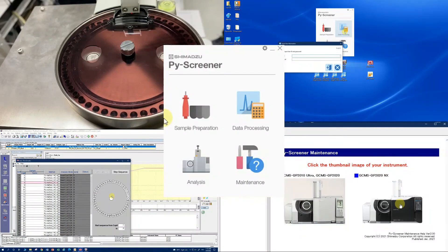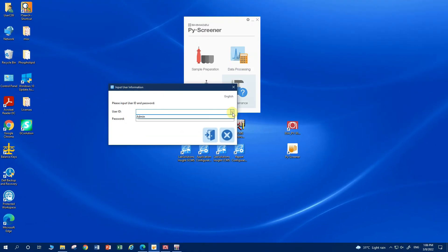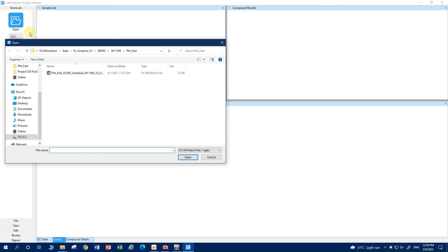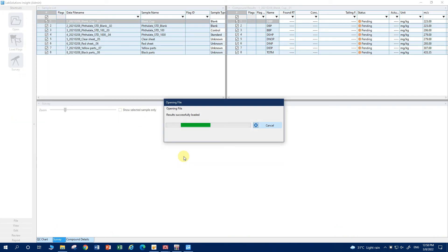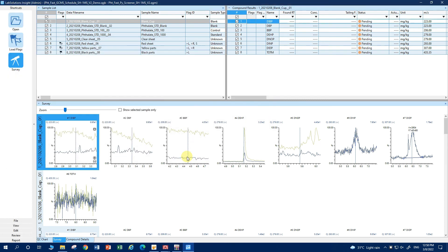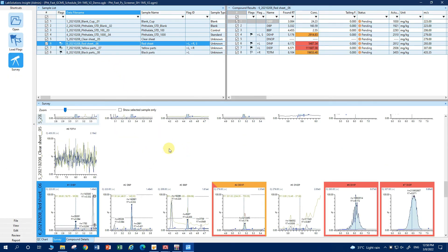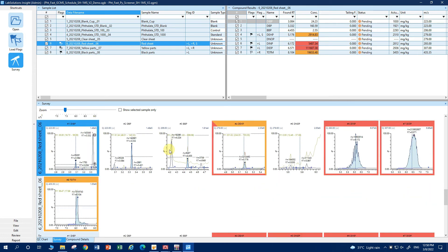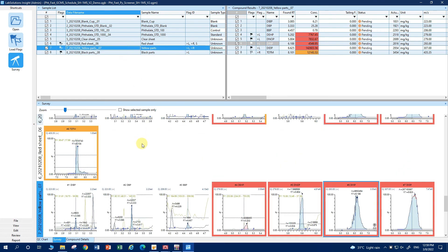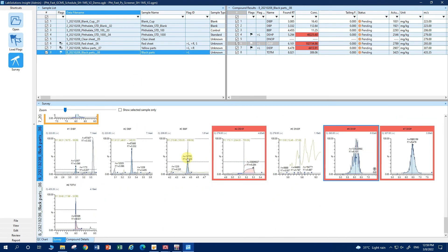Once sample analysis is completed, users can click on the data processing icon to load the software for data processing. Then load the batch table used for sample analysis, followed by the flag files developed by Shimadzu. With the flag function, any QC standard or sample that fails the screening criteria will be highlighted with a striking color. The software has been designed to be more intuitive, allowing users to quickly identify failed samples from many samples.